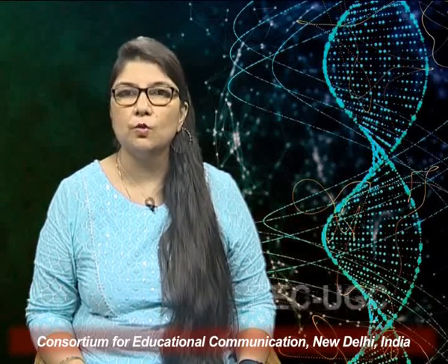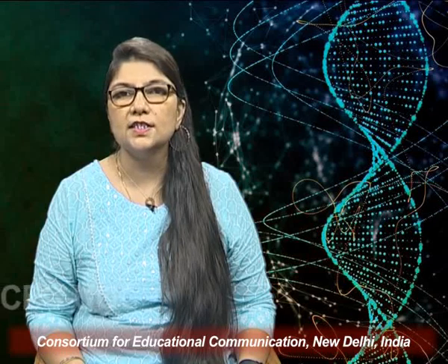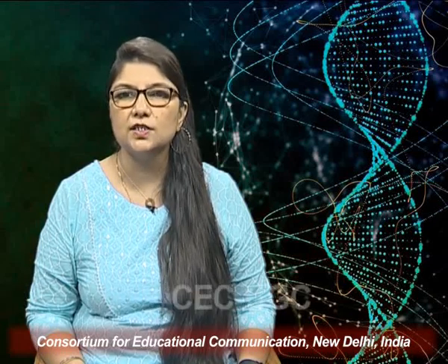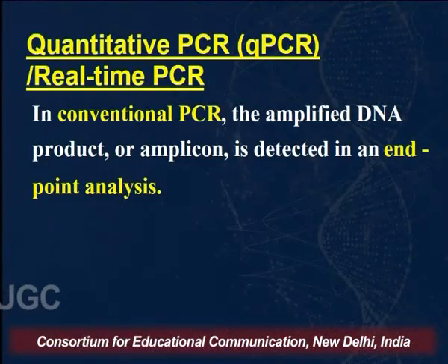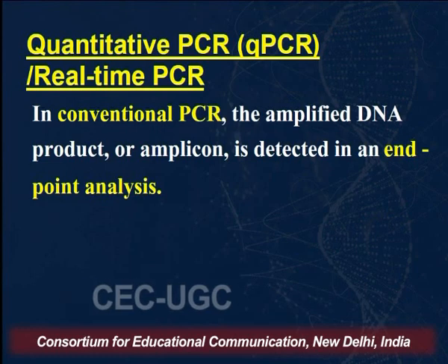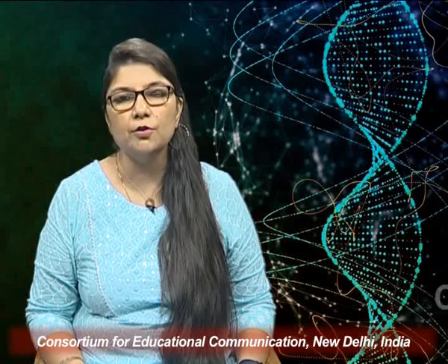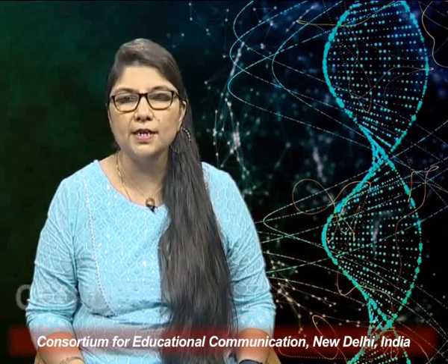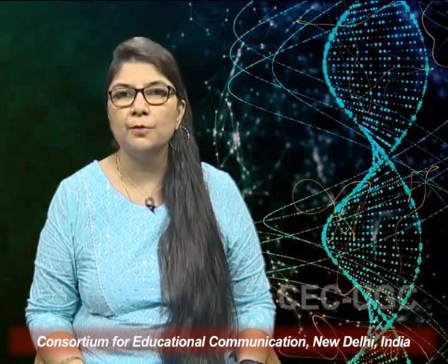Now, when we talk about the quantitative PCR, or as it is called the real-time PCR, we saw that in the conventional PCR, the amplified DNA product or the amplicon is detected in an endpoint analysis. So, we take a template, we put the primers, we use the Taq DNA polymerase, and it undergoes a number of cycles to make copies of that template or the gene of interest that we have given, and then we analyze the result on, for example, the agarose gel electrophoresis. So, what we analyze is the end product or the amplified product.